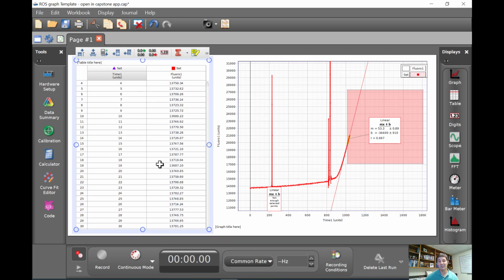If you have more than 20,000, you need to add numbers in the X column. Again, I don't envision there being a reason why you would have more than 20,000 data points in your file, but just as an FYI. So we have enough space. If you have excess data points on the X side of things, it doesn't really matter. It only plots when there's an X and a Y.